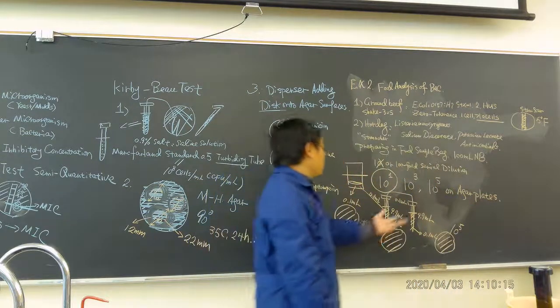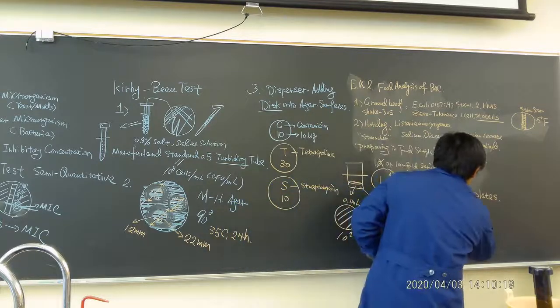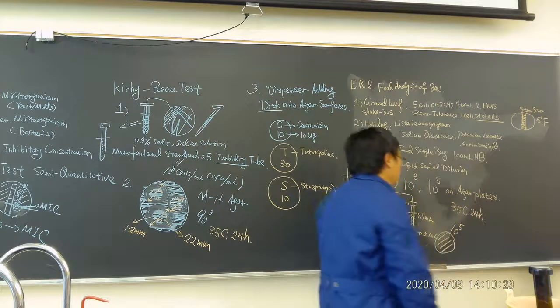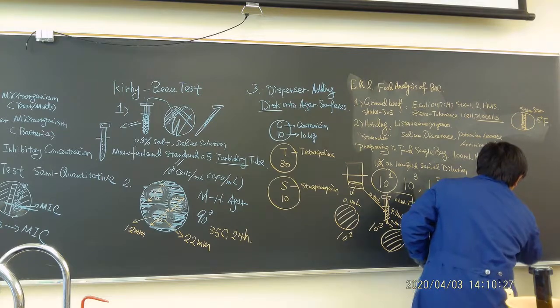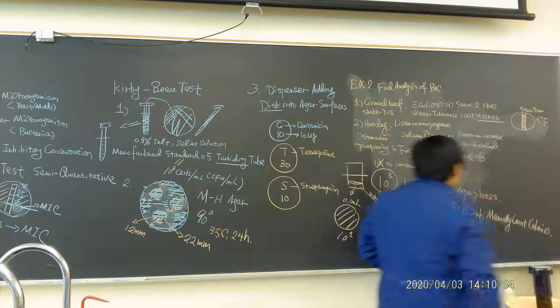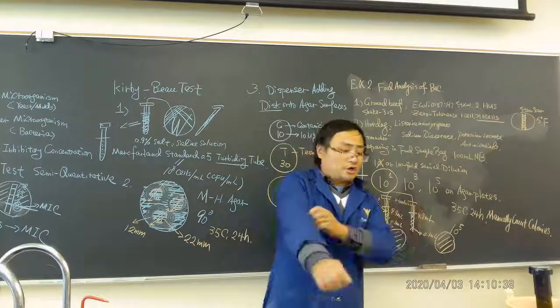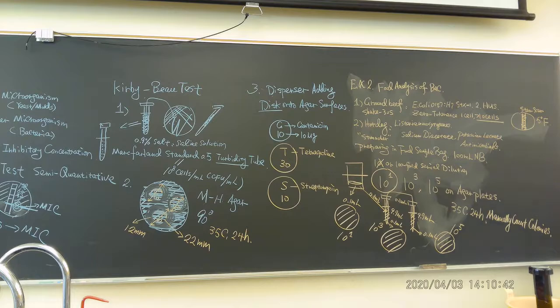Okay. Then we're all going to do an incubation at 35 degrees Celsius for 24 hours. Then you have to count the colonies there. For you, it will be 1 week, manual count of colonies. Okay? So that's the procedure. Now I want to show you how we do that. I'll give you some examples.